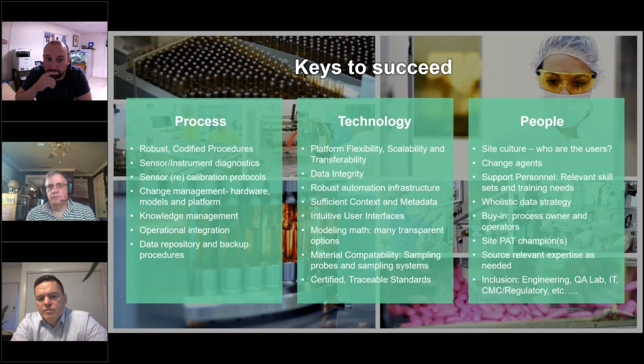Yeah, maybe we should also pull out this one, which is called data integrity, Chuck, because of course, when we are working, particularly in regulated environments, data integrity is key. But even if you are in a non-regulated environment, we need to be able to trust our data. We need to have good systems for pulling the right data, and we need to have traceability for our data. So data integrity is really the key when we are basing our insight, our understanding of the process or the reaction, on the data themselves, right?